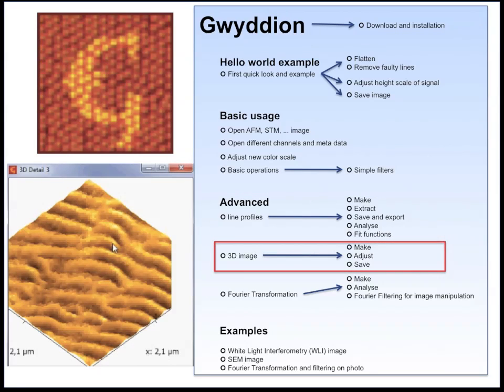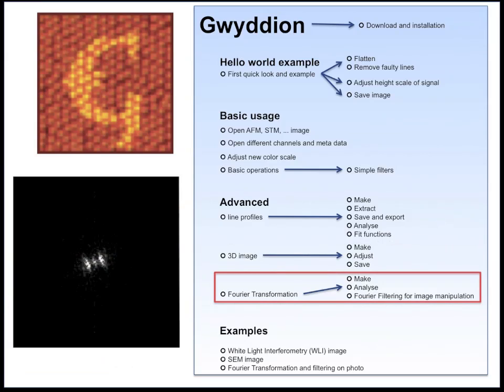Then I will show you how to generate such a 3D image from your data. And after that, I will show you how to Fourier transform images or Fourier filter images, which is really worth knowing and worth looking at.